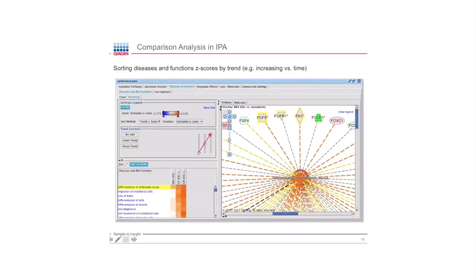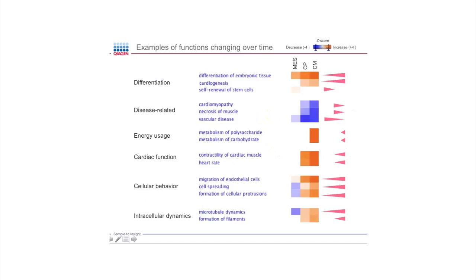I'm going to mention this later, but this little fuzzy yellow halo is indicating the isoforms, that there are multiple isoforms in the data set. Whereas FOXC1 only had one transcript that was measured, these ones, which are off yellow, had multiple, and we'll go into that.